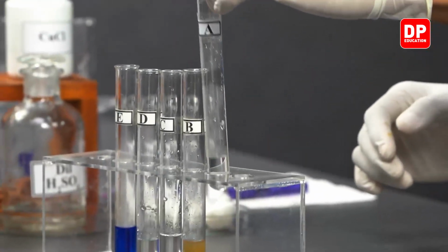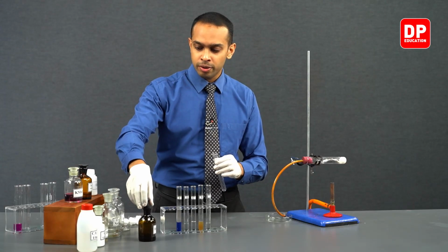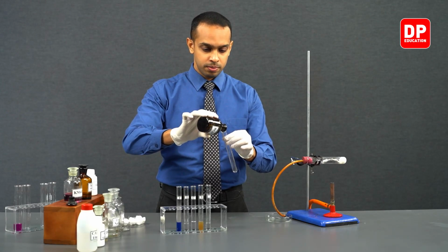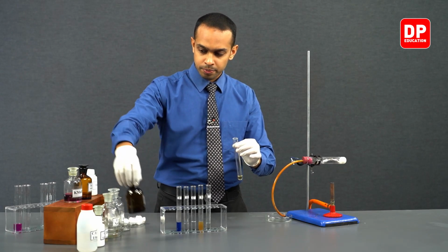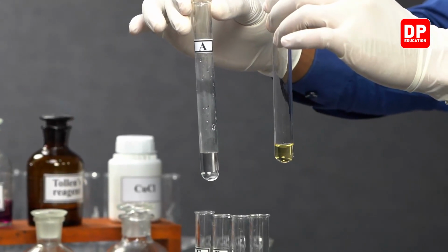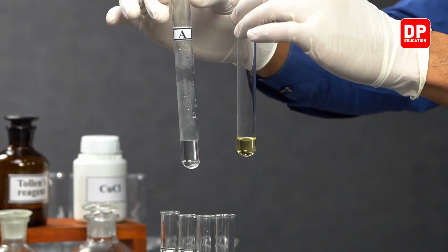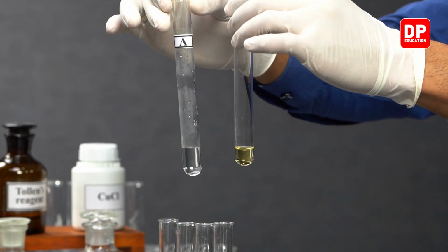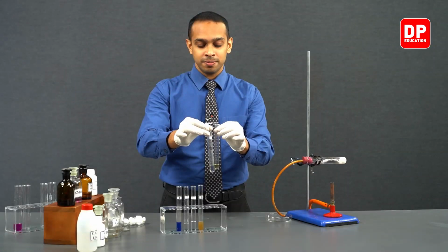To observe the initial color of bromine water, we'll take another test tube and take a small sample of bromine water into that test tube.